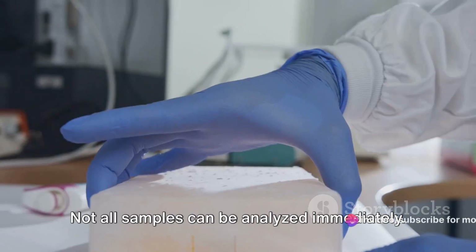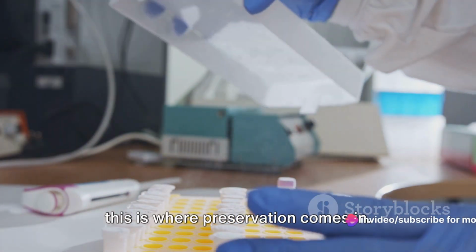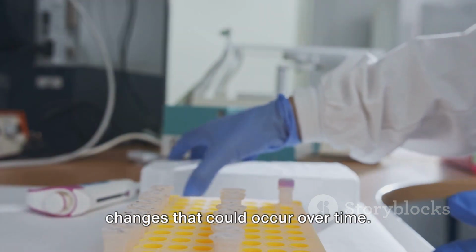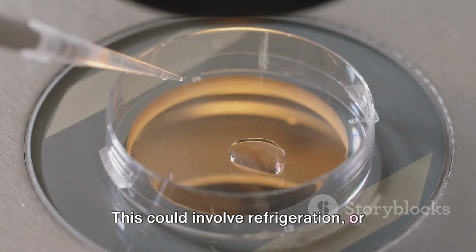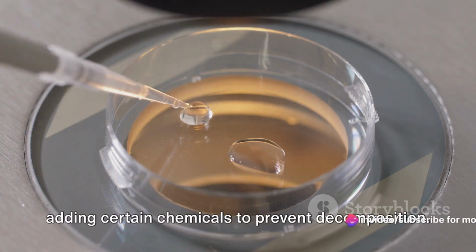Not all samples can be analyzed immediately. Some need to be stored for a while, and this is where preservation comes in. Preserving your sample prevents any changes that could occur over time. It's like putting a pause button on your sample's properties. This could involve refrigeration or adding certain chemicals to prevent decomposition.